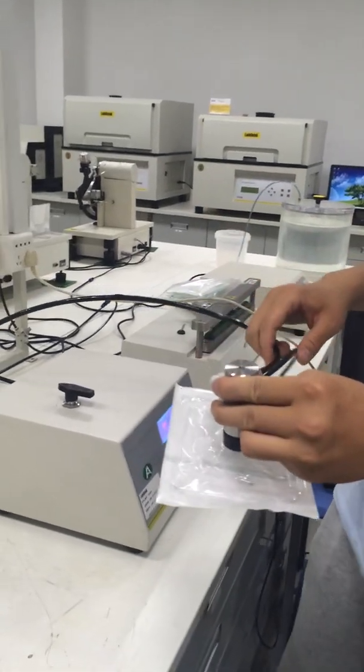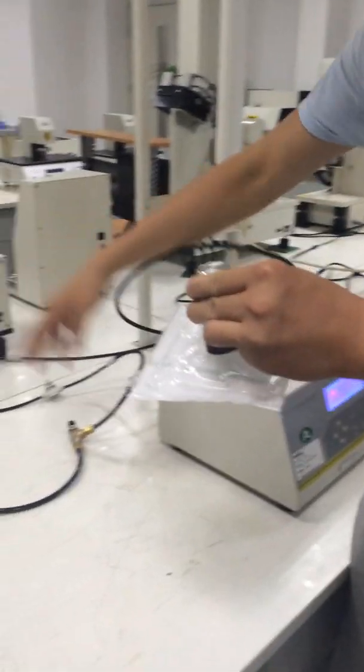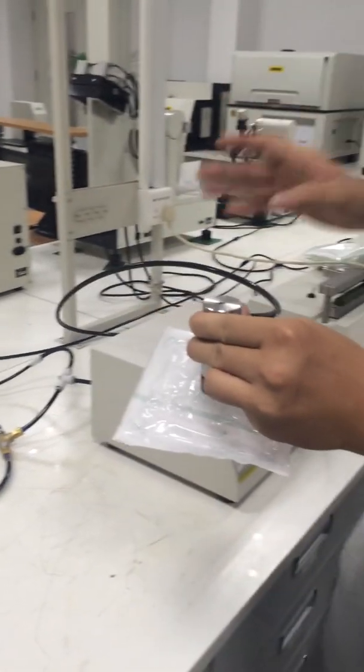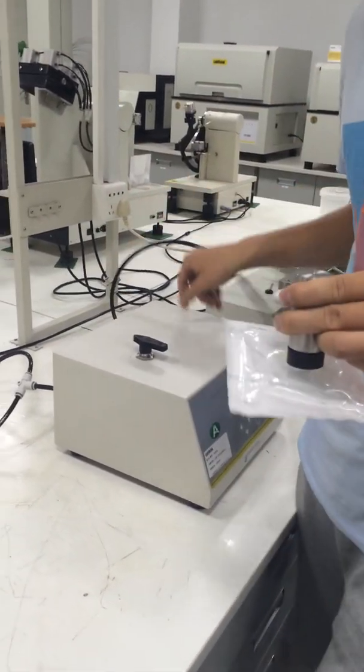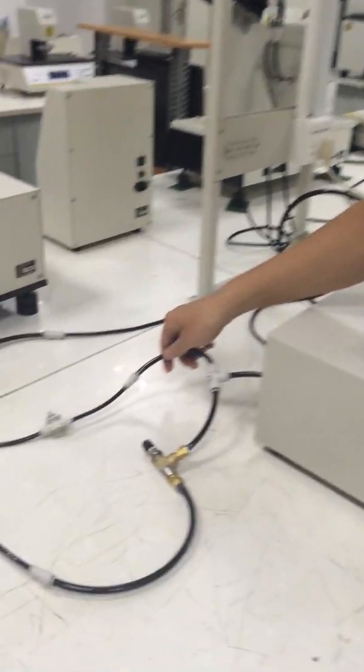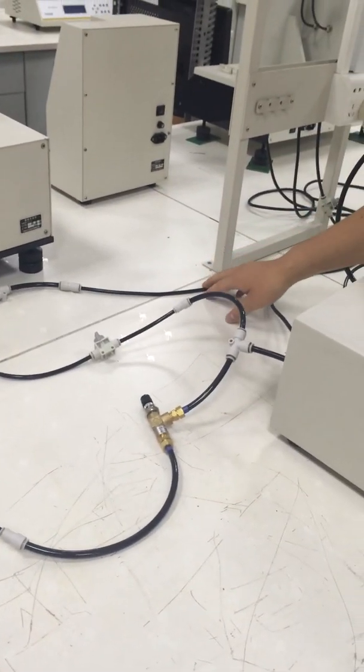Okay, now I will introduce you how to use these fixtures to let the bubble test perform normally. Basically, we added two pipes for the gas inlet.